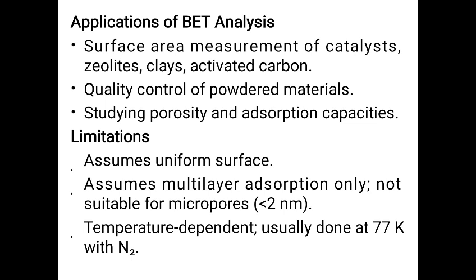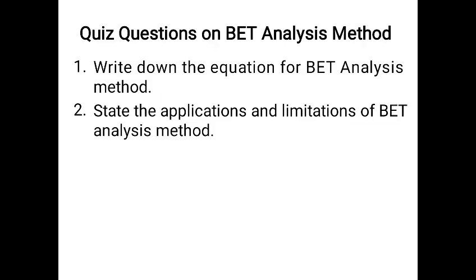And it also has certain limitations. We have to assume a uniform surface for obtaining the BET analysis. It assumes multilayer adsorption only, and therefore it is not suited for micropores that are less than 2 nanometer, and it is also observed to be temperature dependent and usually done at 77 Kelvin with nitrogen.